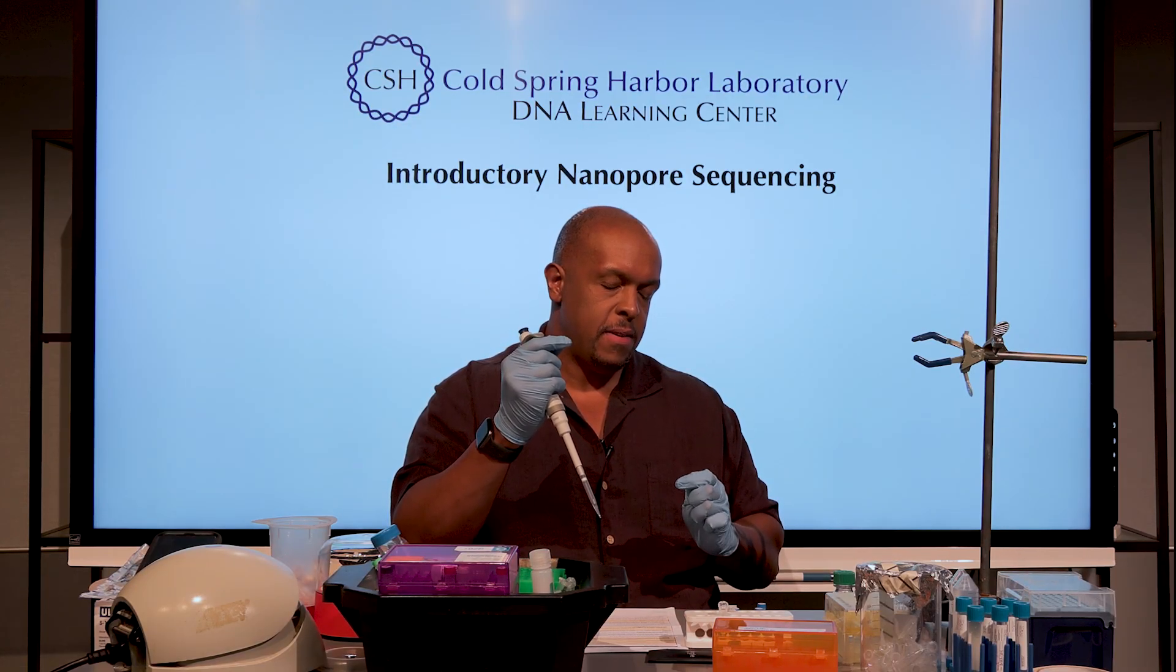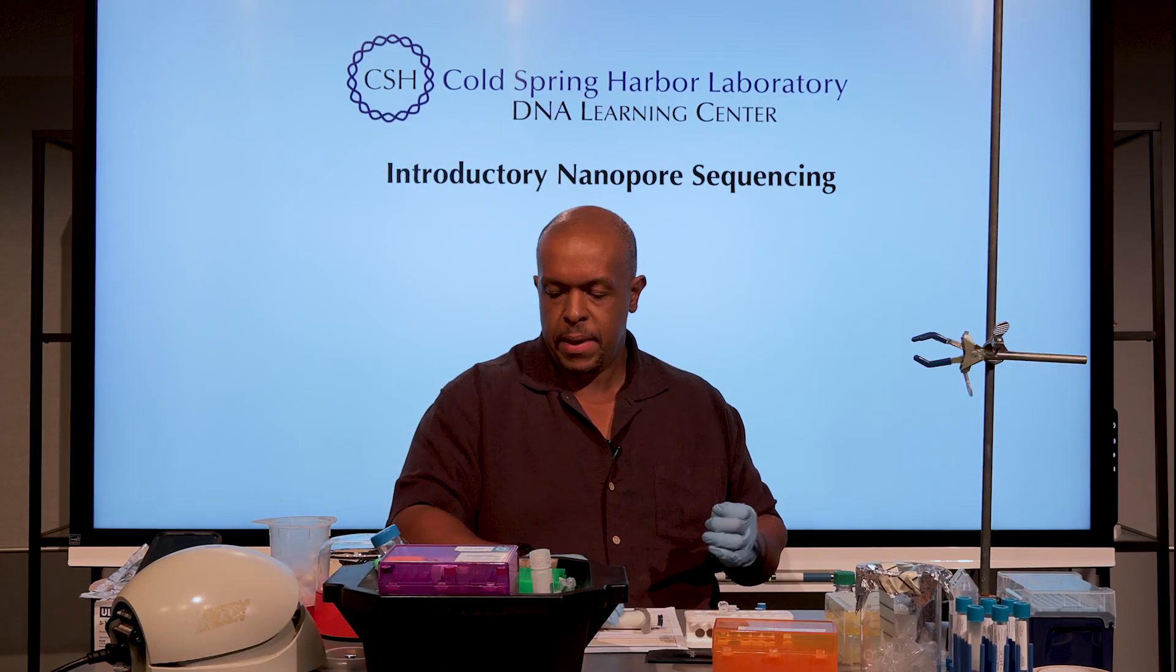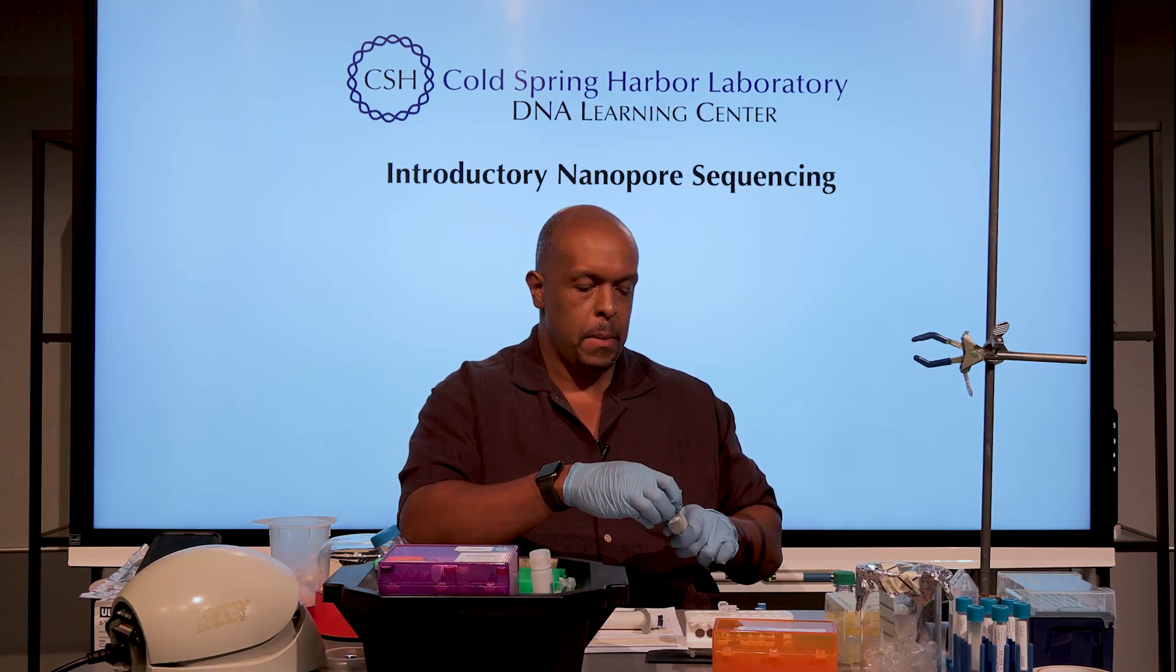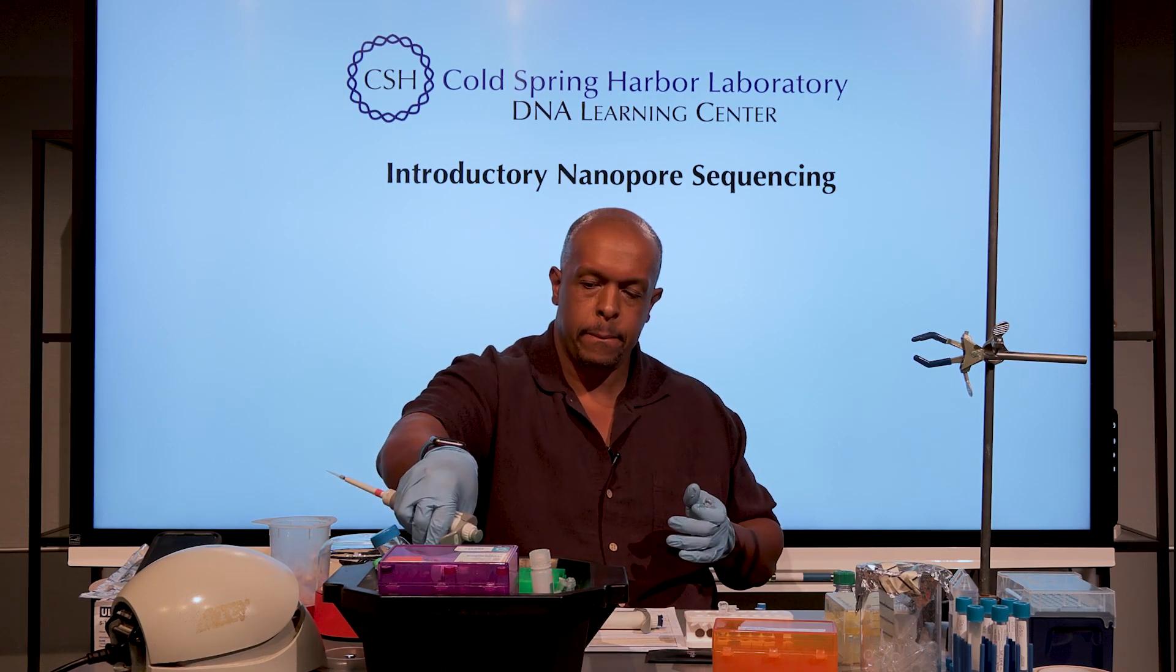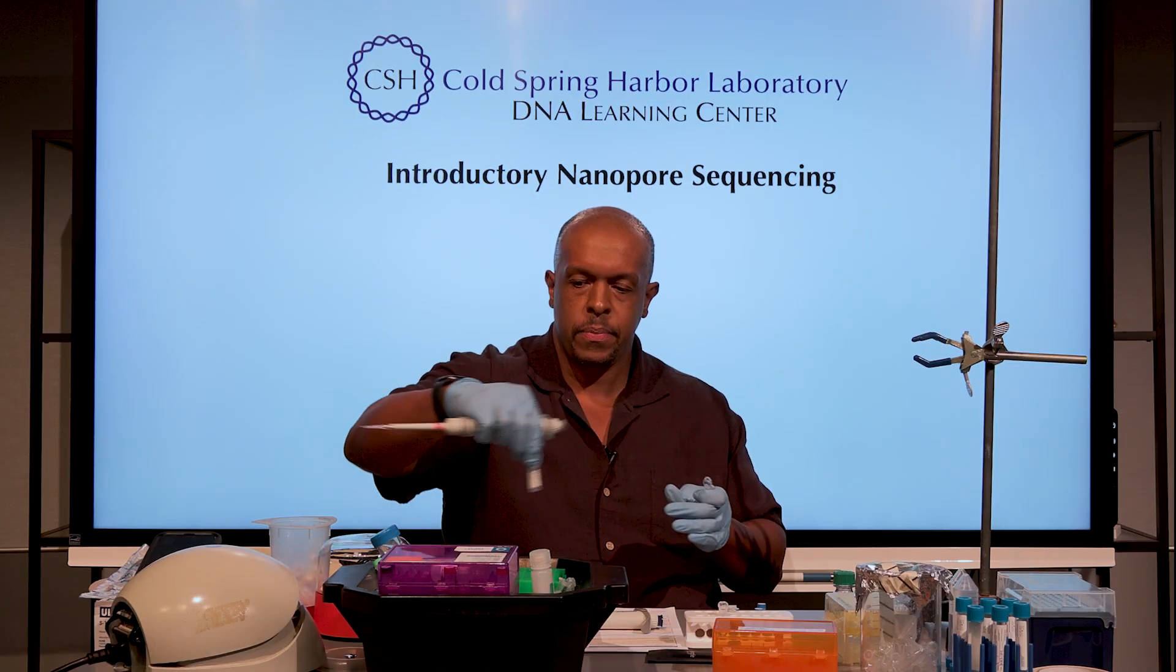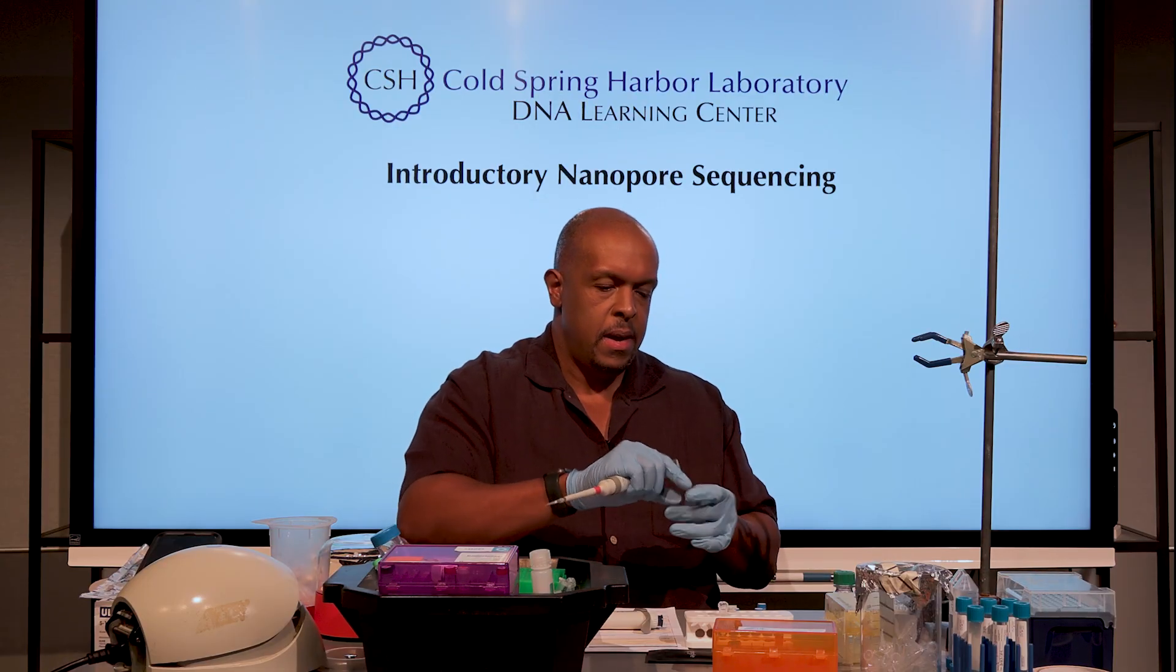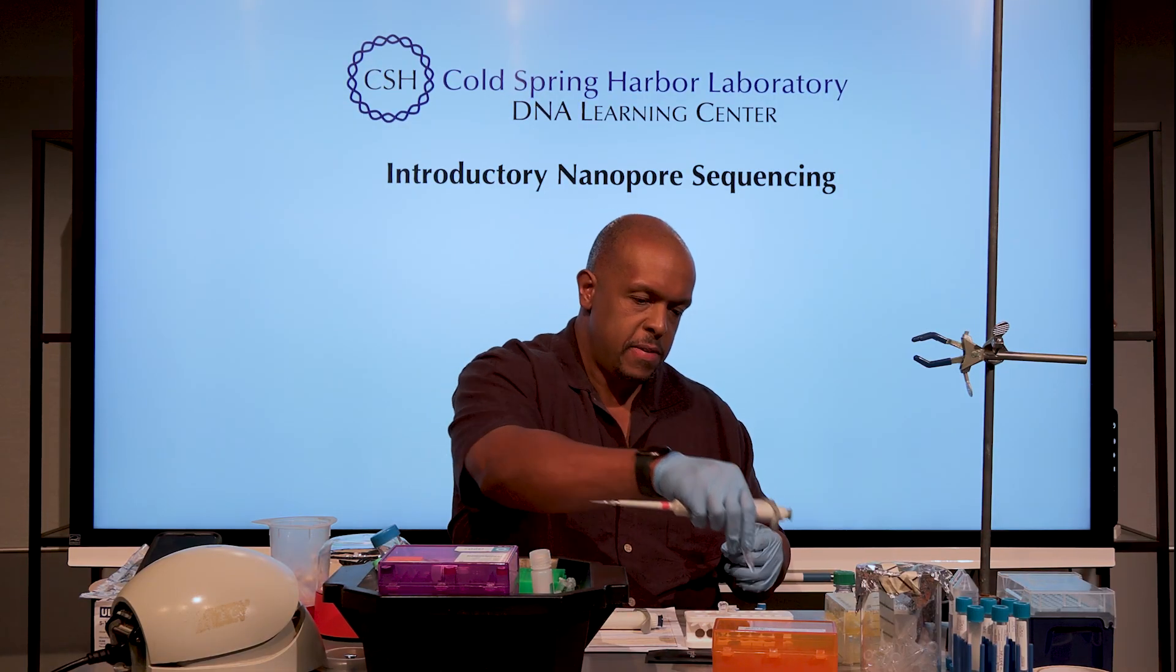These are fine not sitting on the ice, but I'll put them right back when I'm done. Just 3 microliters of the tether. I've spun it, I've mixed it, I've spun it down.